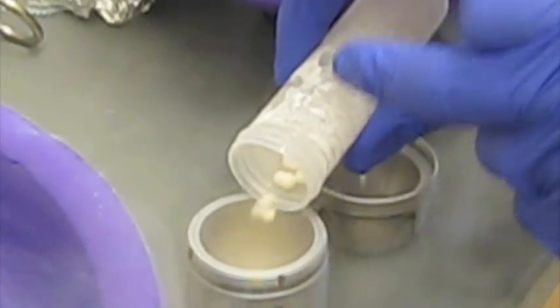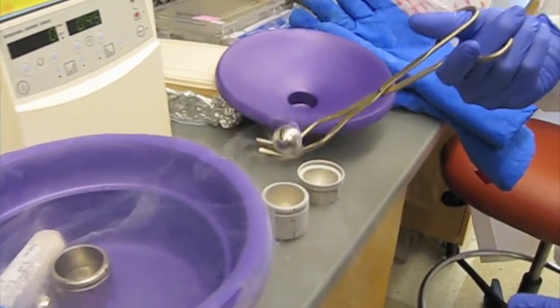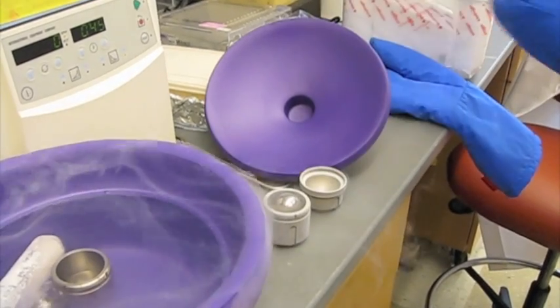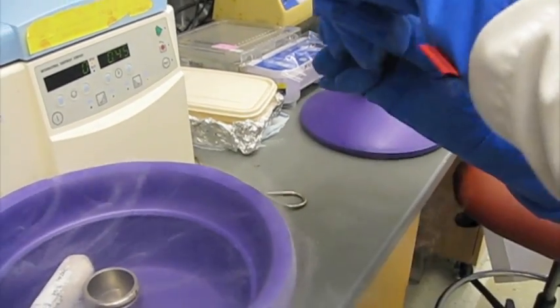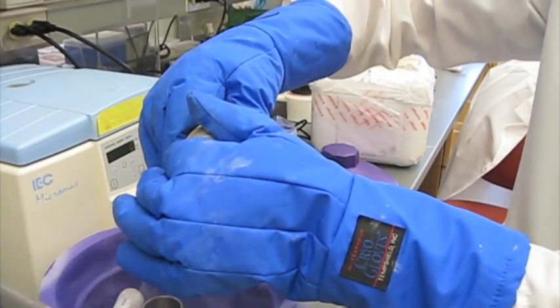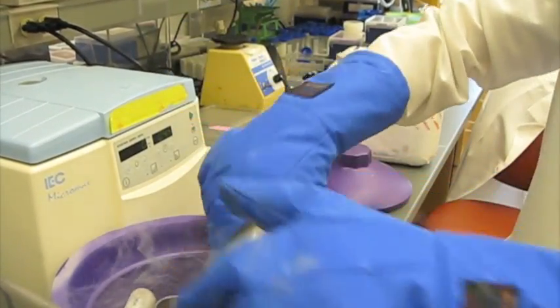We fill it about halfway or so, then we're going to put one of the ball bearings in. Before you thread it on, we want to make sure that we drain out any residual liquid nitrogen — almost like you're making martinis. Then we'll screw it down and put it back in.